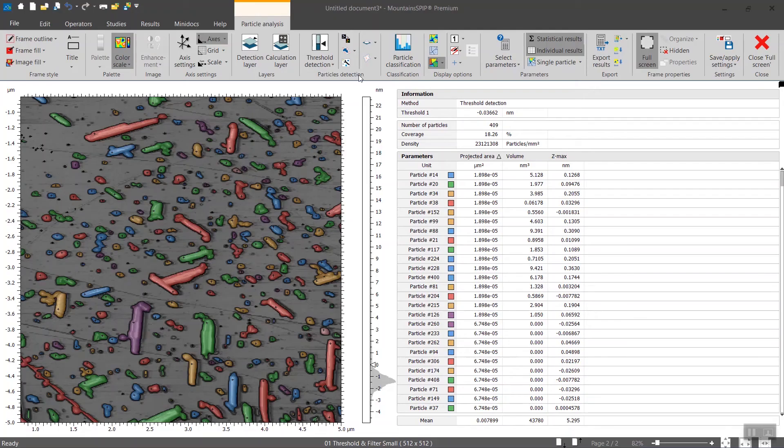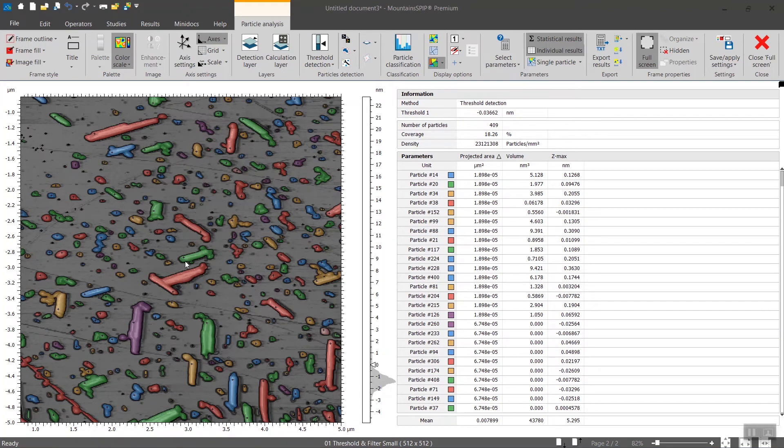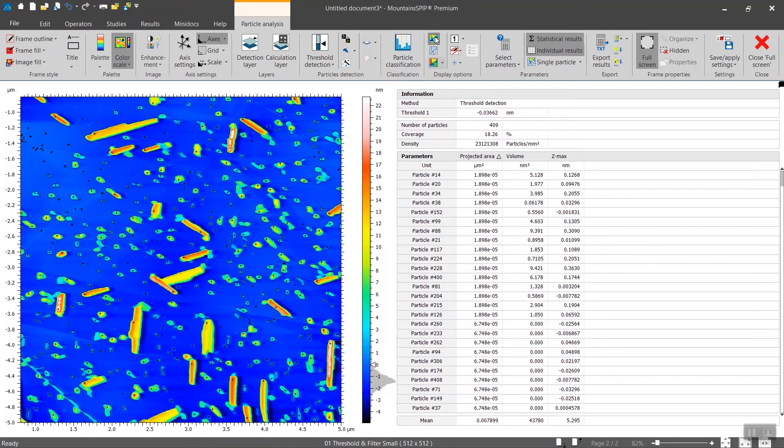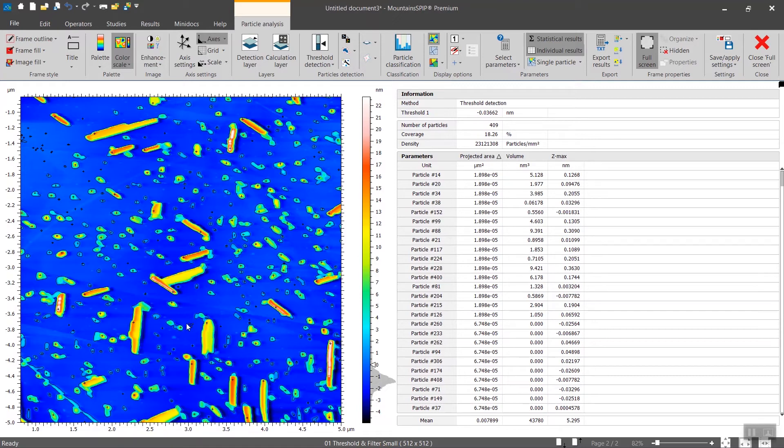There are a couple of sections in the particle analysis tab. For instance, by default the particle view here is in colored mode which will be convenient when we cover the classification. But in the initial stage of particle analysis I recommend displaying the topography. Then you have the outline of the particles overlaid over the topography.